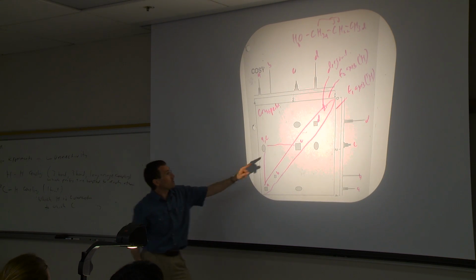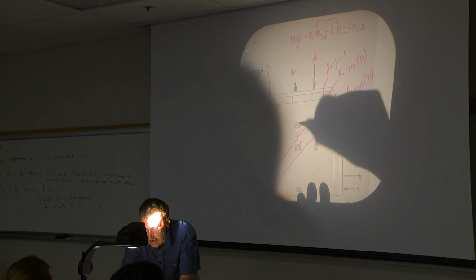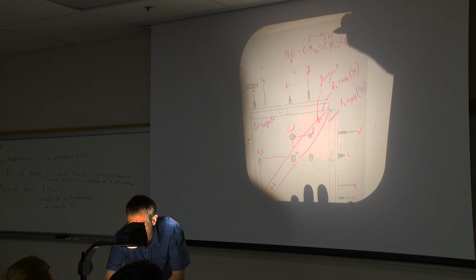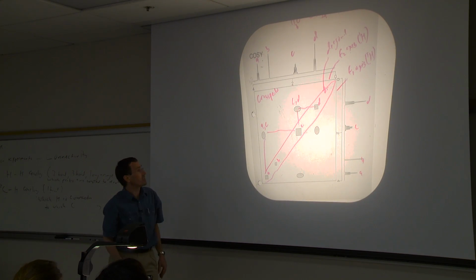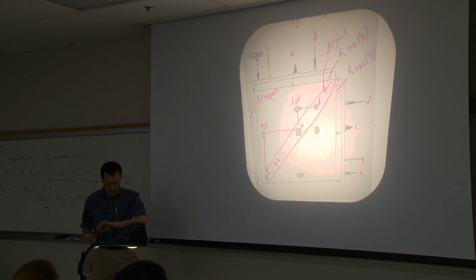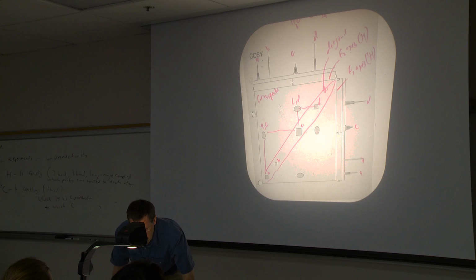And the next cross peak, again sort of in the style of Battleship, is C cross D. And that's telling us that our methylene C is coupled to D. So there we go. That's basically reading our cross peaks and using that to get what we would otherwise only get from pattern recognition. All right, so that's a COSY.